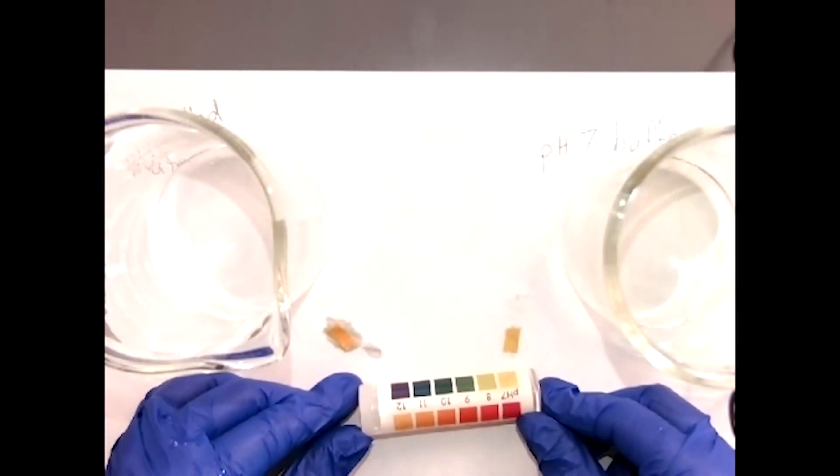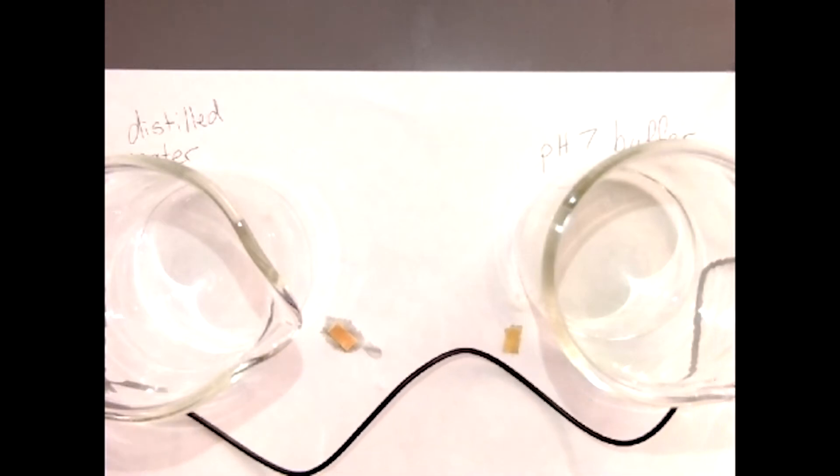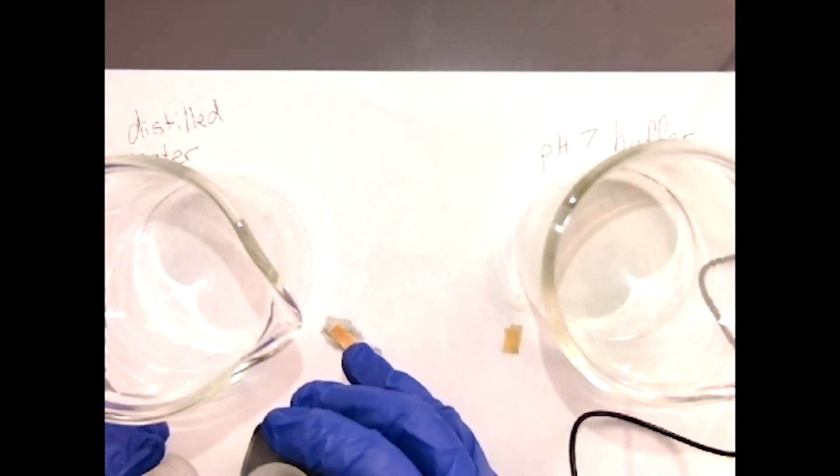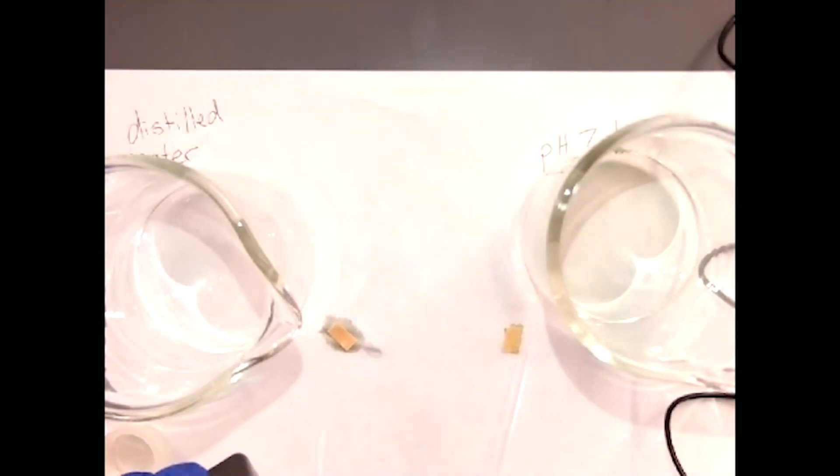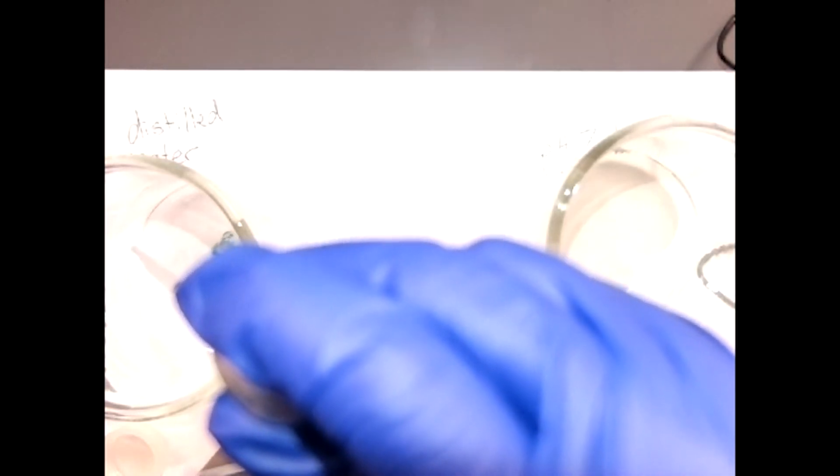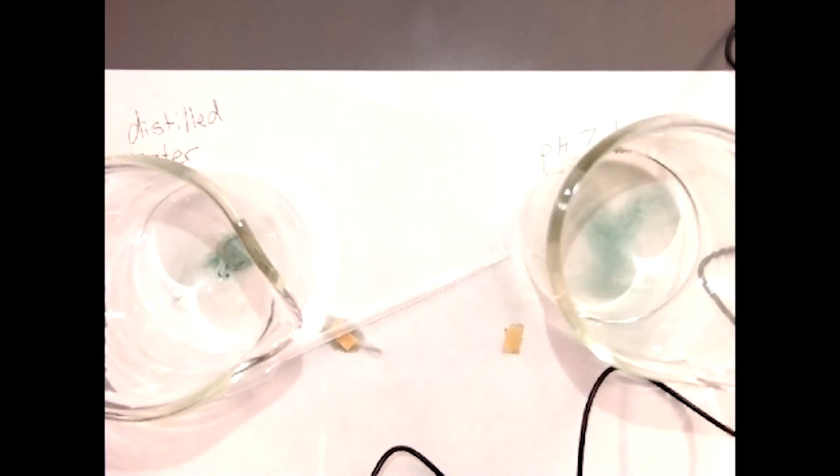We'll take six drops of bromothymol blue and add it to each beaker. Six drops in each one: one, two, three, four, five, six. One, two, three, four, five, six. Mix by swirling the liquid.